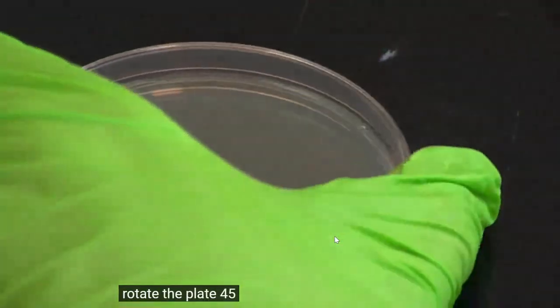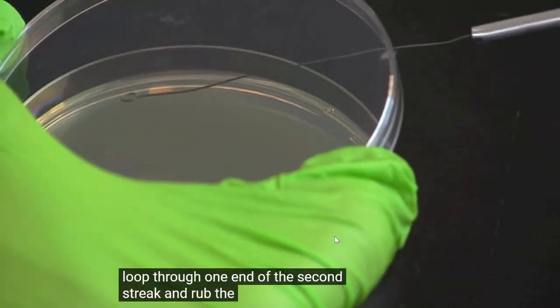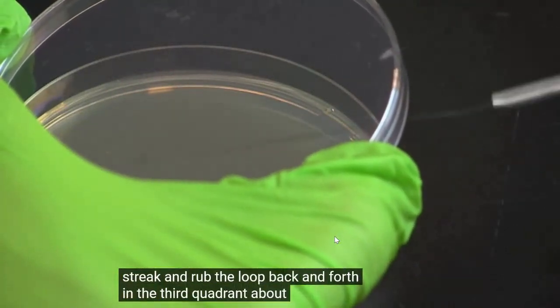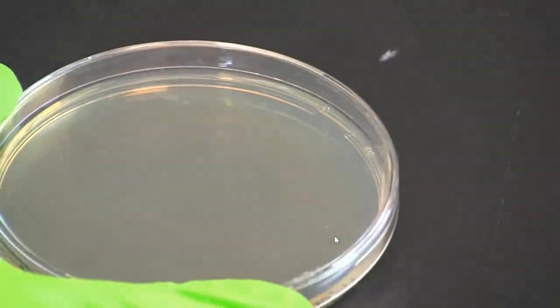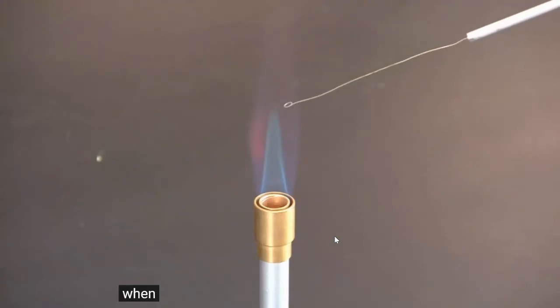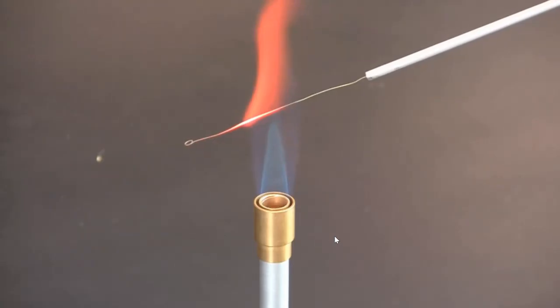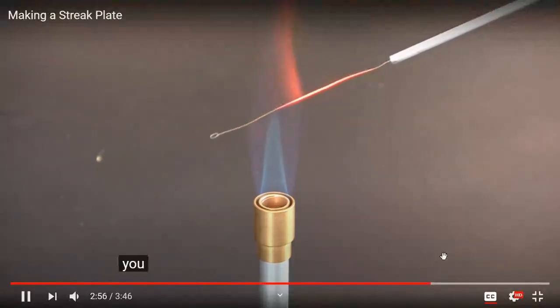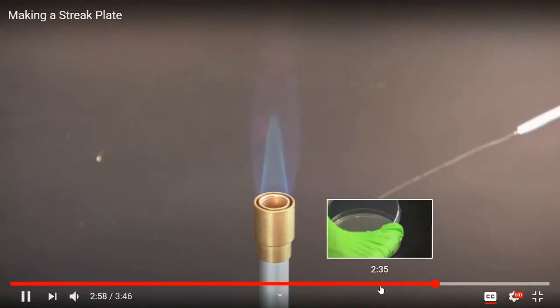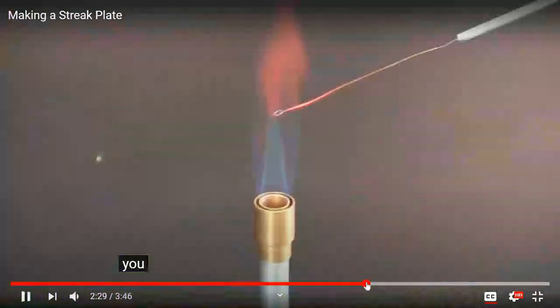Rotate the plate 45 degrees and draw the loop through one end of the second streak and rub the loop back and forth in the third quadrant about 10 times. When finished, flame the loop again. Repeat the process one final time.